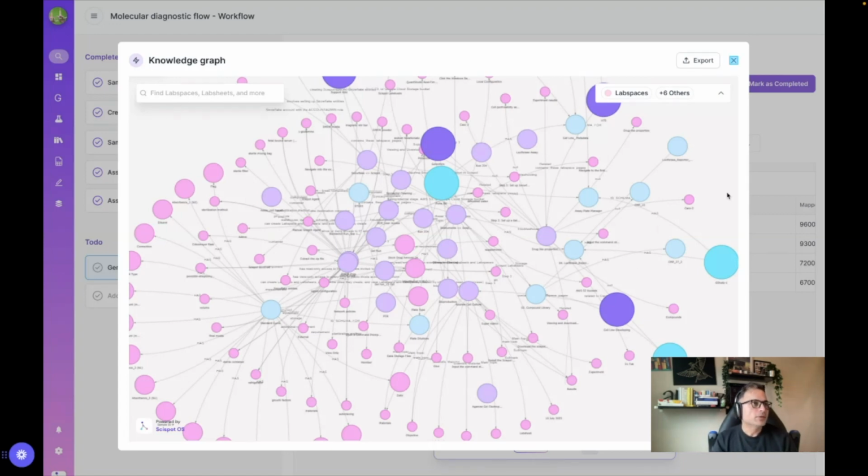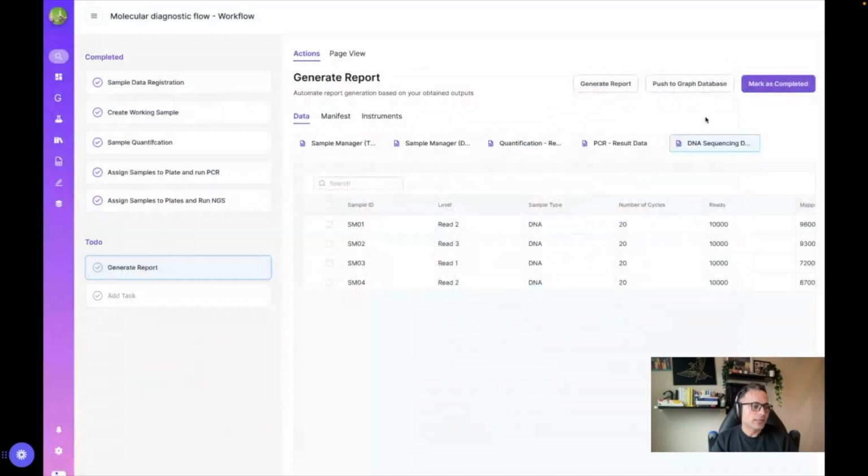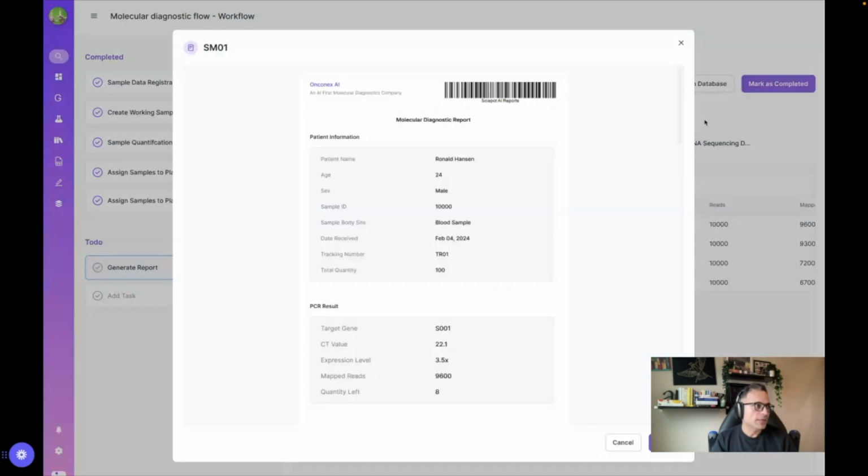Okay, the other thing I want to do is talk about the report, which is also another big use case that you've seen: can I automate my report generation as well? This can be done in two ways. One is using the generative AI report that Scispot generates based on the workflow that you just saw. The other option is you can provide prompts to this report. Think of it like if you use ChatGPT, you provide certain natural language prompts to get answers. So there are two options.